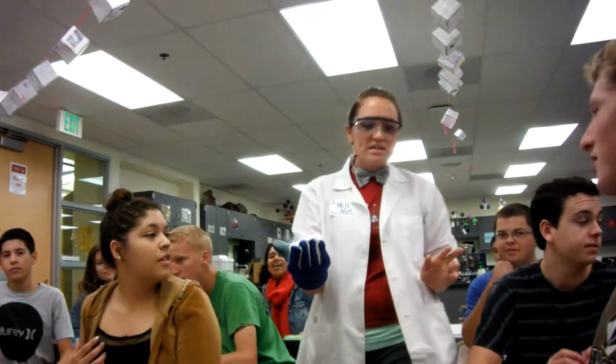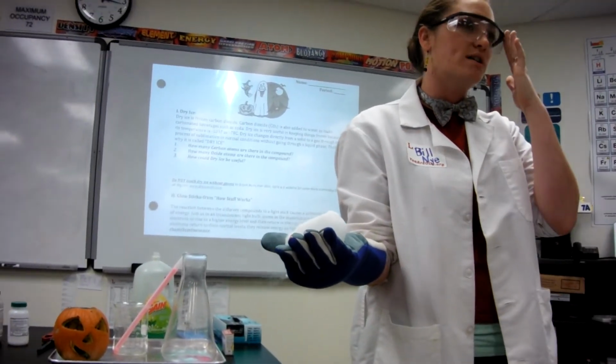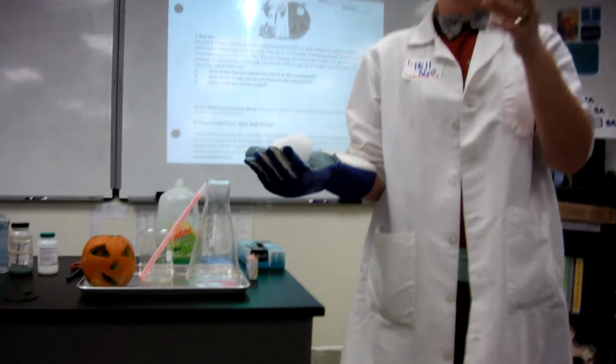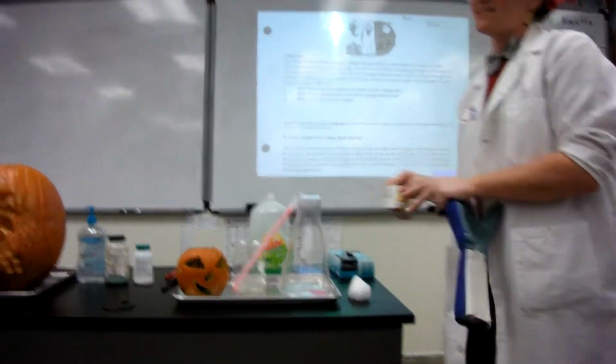Oh, and the safety stuff is you never ever want to touch this with your bare skin. I can feel it. It's really cold even through the glove. So I'm not even going to hold it in the glove for a long time. You would never want to put it in your mouth because then you have frostbite on your tongue and that's sad.